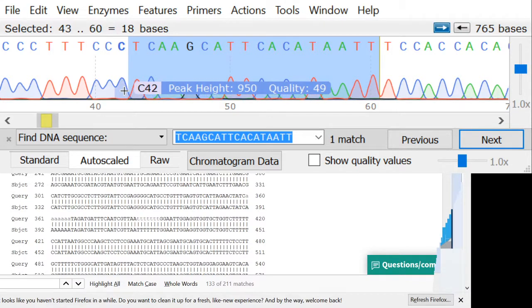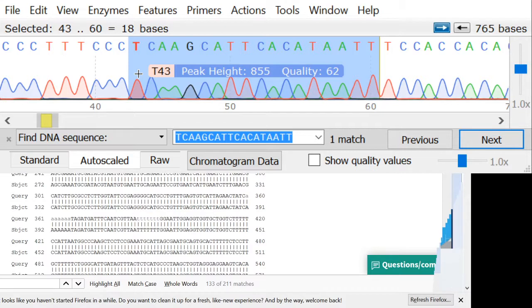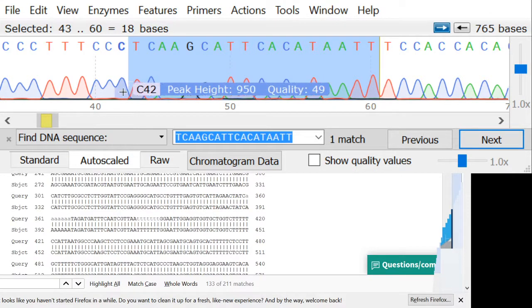So what I was looking for is you saw in the alignment here that I got a C where they have an A. So I was thinking that maybe right here there would be a C and an A on top of each other, and that would indicate there was some kind of problem, some kind of error. But that's not what I'm seeing. What I'm seeing is a really good solid C there with no noise, nothing funny about the shape at all.